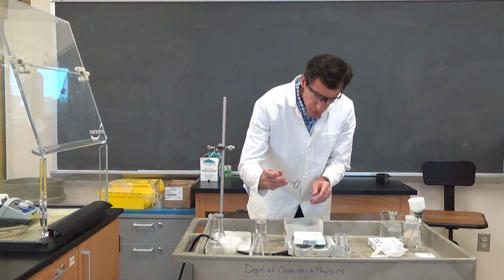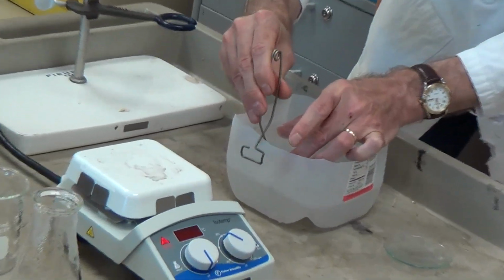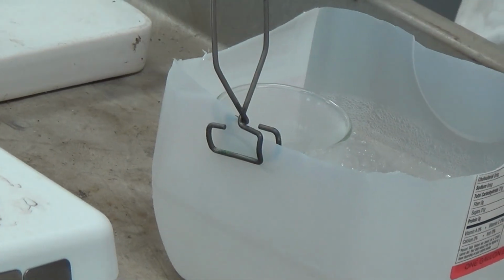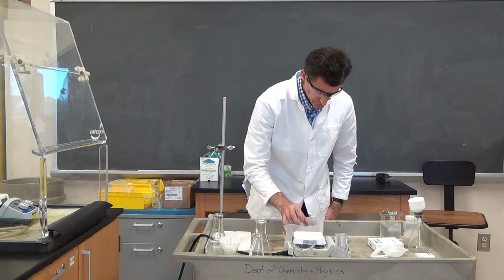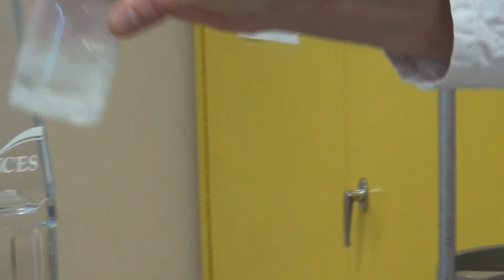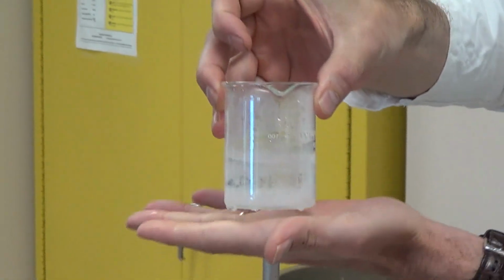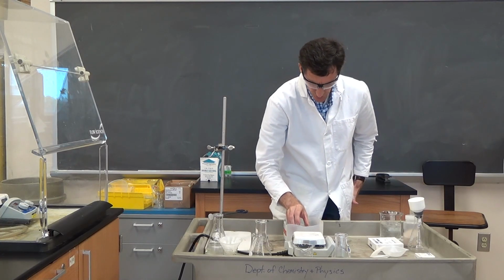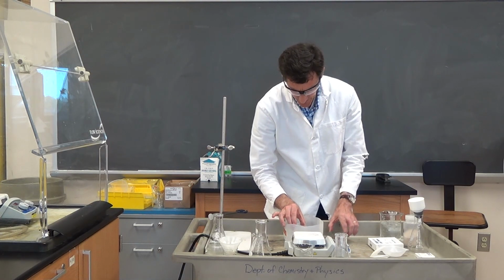I've seen students sometimes use your test tube holder and sometimes clamp it like this. I've never done that myself, but a lot of students do that. Take a look at it. You can see we're getting a good amount of crystals forming now out of the water. It's still actually a touch warm. It's cold on the bottom, room temperature sort of on the sides. Certainly it can chill a good bit longer. At this point, we let it chill sufficiently.